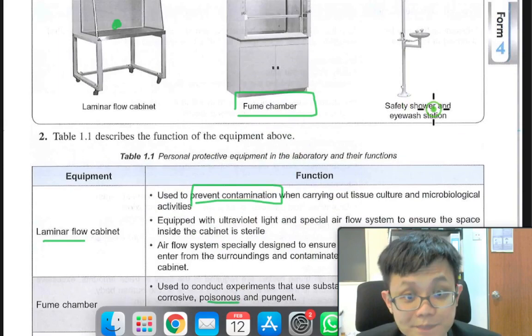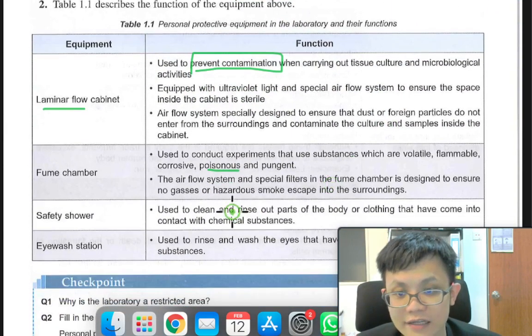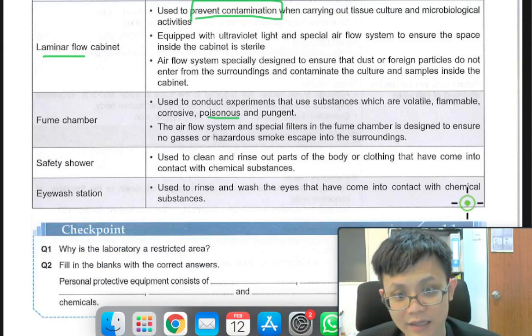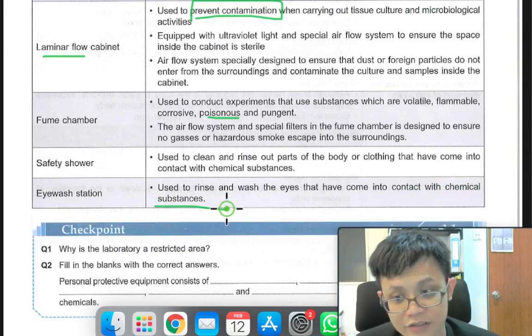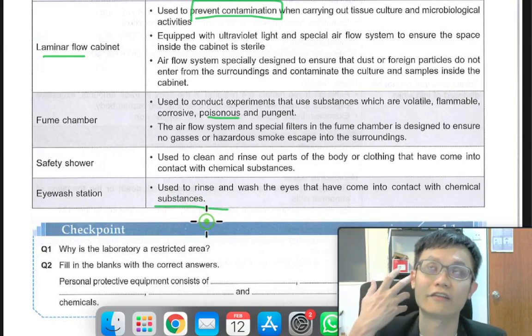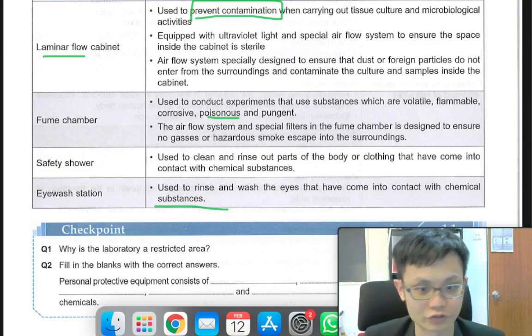Safety shower and eye washer, okay? Used to clean and rinse parts of the body or clothing that have come into contact with a substance. Eye wash station, in case something gets into your eye, like suddenly your eye feels very painful because something went into it. So what should you do when you are in the science laboratory?